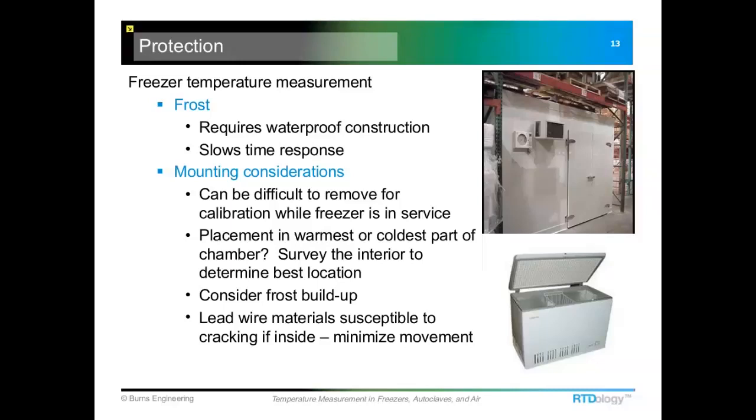And then you want to make sure that frost doesn't build up around it, because that's going to slow down the time response, and your freezer could shut down and the probe would still be saying it's the right temperature 2 hours later because it's buried in frost. So those are just a couple of the real important features to look for in a temperature probe.